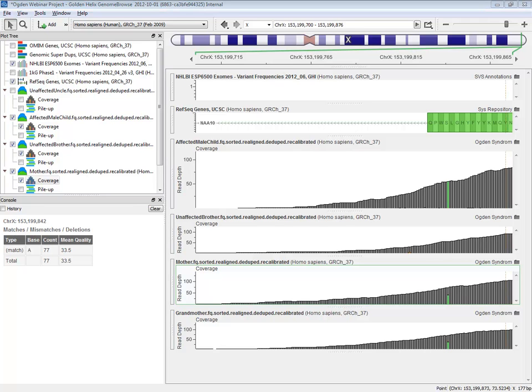What is the evidence for selecting the cutoff for high quality variants of 10x and Q20? As I mentioned, there's no way to say with complete certainty that you will never remove a potential candidate variant, so essentially have false negatives by doing this type of filter. What I can say with certainty is that if you don't do that type of filter, you will have an enormous number of false positives from genotypes based on one or two reads.